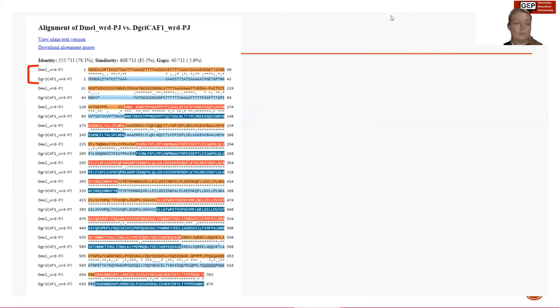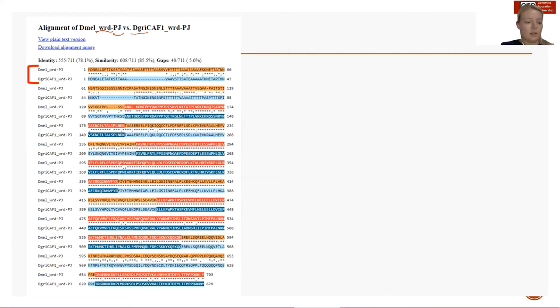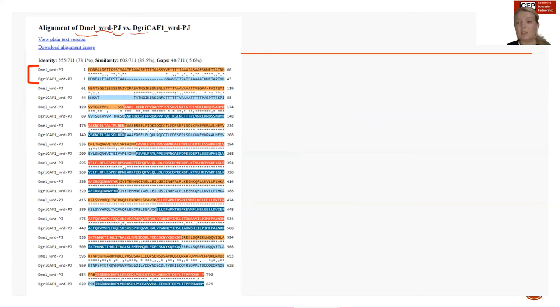Here we are looking at an actual protein alignment generated from GeneModelChecker. This is of the gene WRD isoform PJ, and we are analyzing in the species Drosophila grimshawi. We always align against Drosophila melanogaster because that is our model organism. A protein alignment shows us the amino acid sequence similarity between the particular isoform of a gene you had just annotated and the same isoform of that gene from melanogaster.